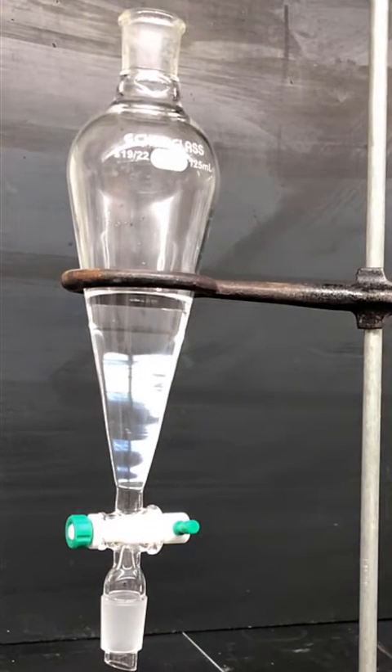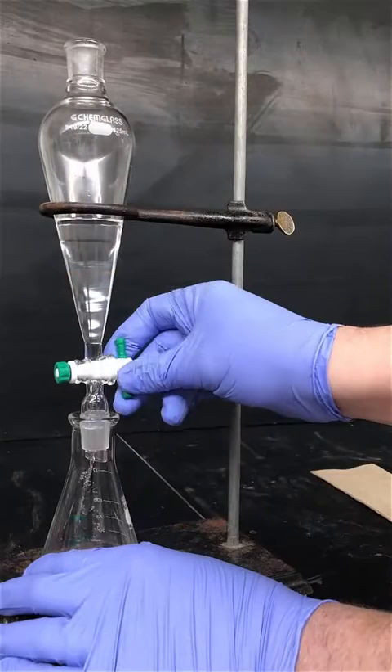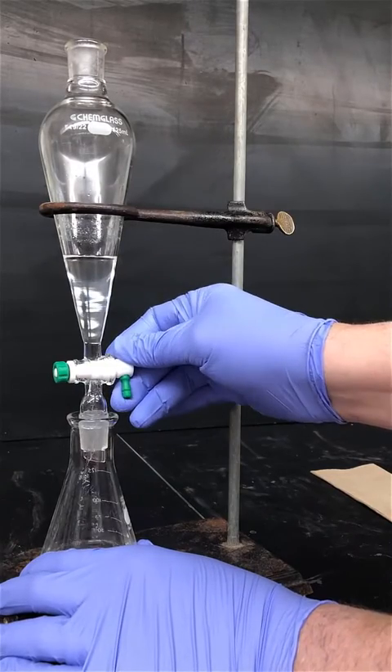You can tell based on density which layer is the product layer. Tert-butyl chloride has a density that's less than water and less than hydrochloric acid. Therefore the top layer will be the tert-butyl chloride layer and the bottom layer is the aqueous layer. Drain the lower aqueous layer out of the bottom of the separatory funnel.